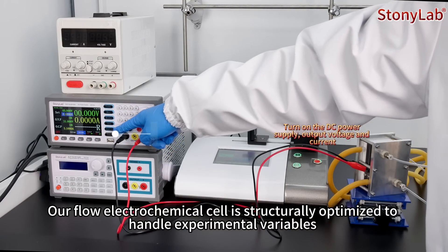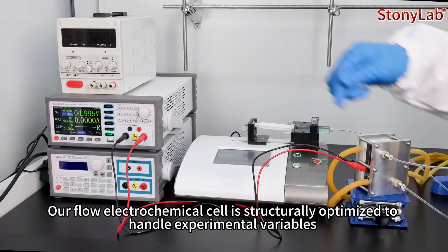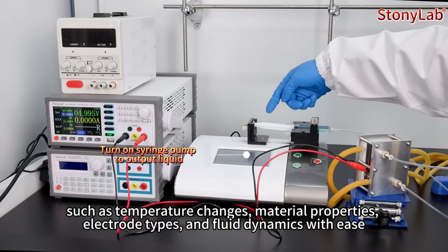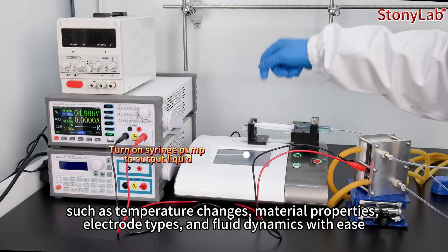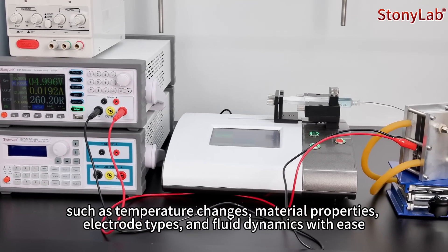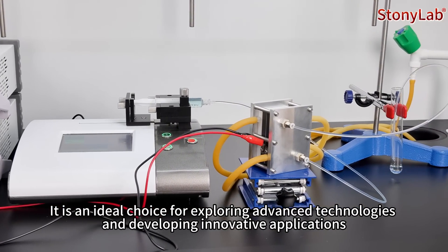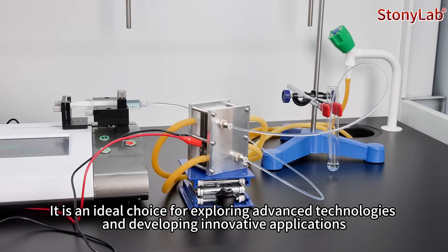Our flow electrochemical cell is structurally optimized to handle experimental variables such as temperature changes, material properties, electrolytic types, and fluid dynamics with ease. It is an ideal choice for exploring advanced technologies and developing innovative applications.